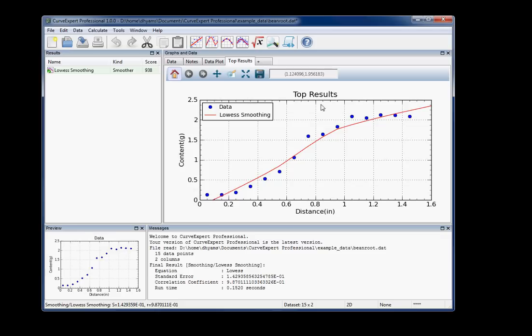In this Graphs and Data pane over here, you can see that a graph has been created on your behalf with the lowest smoothing on it, as would be expected. And just a quick explanation of the different areas of the CurveExpert window here, you have all of your results tabulated over here in the left-hand pane, in the Results pane.